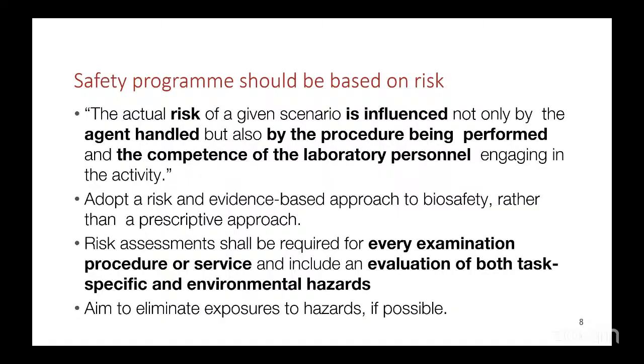Now the aim of it is to eliminate exposure to hazard if possible. That's the essence of a safety program.